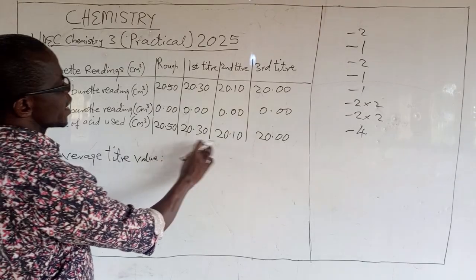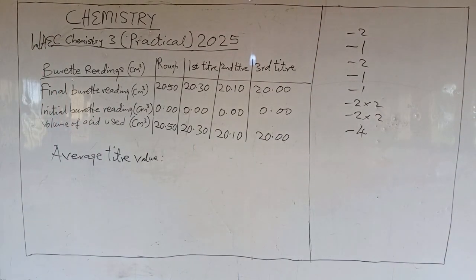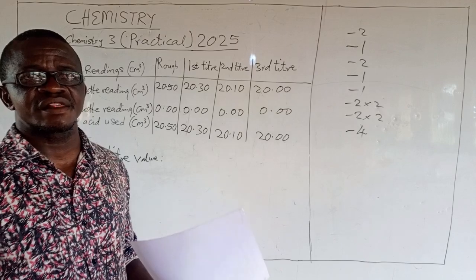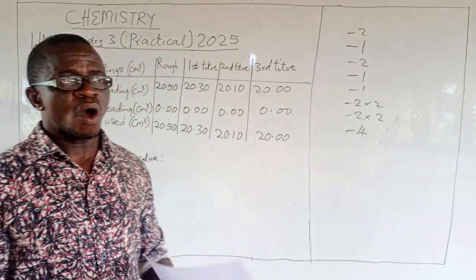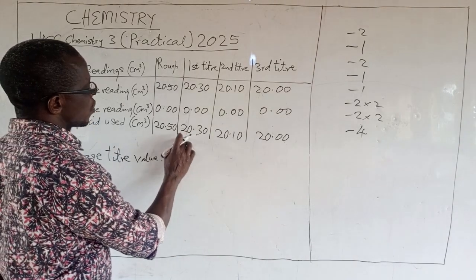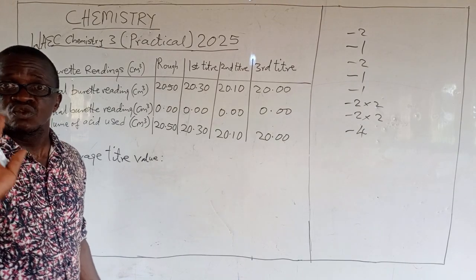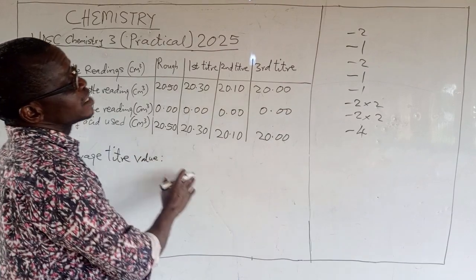Now you check which of the 2 are concordant. Look for concordant values, two that are concordant. Some persons like using three. Some students use two. All are the same. But if you are using three, for example, you want to use this, and this, are they all concordant? Check. If they are not all concordant, do not use them, else they will penalize you.